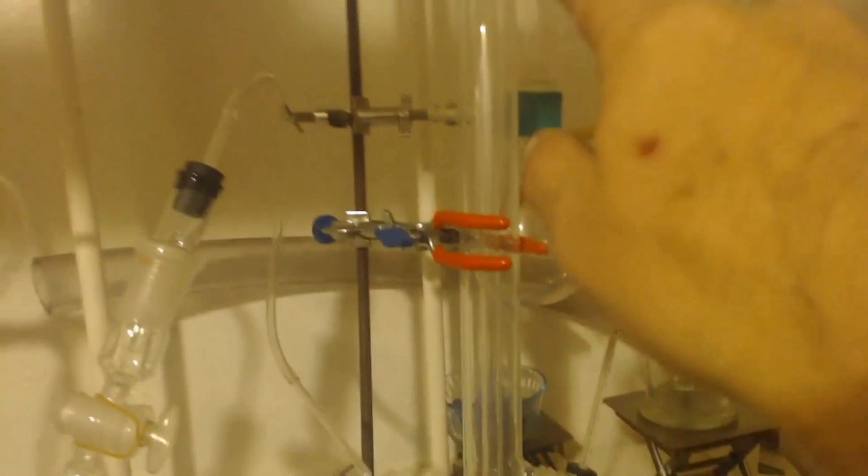Also, this is a water-cooled condenser. I have my condenser over here. As you can see, there's the acid in the funnel. Got the calcium hypochlorite down there. I'm going to drip it on to make my chlorine. Over here is my calcium chloride. That'll help dry it. Come through this suck back and into the reaction. As you see, I already have DCM in there.